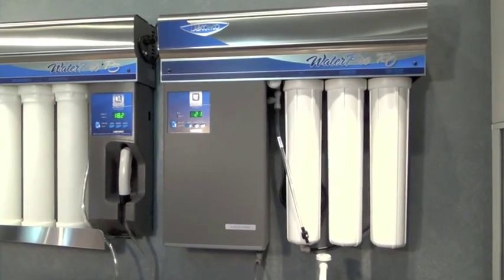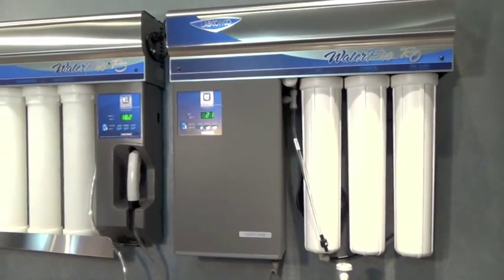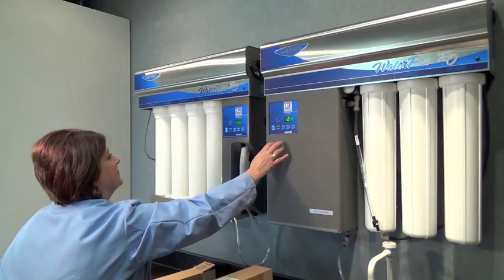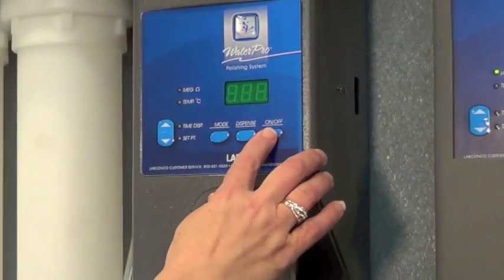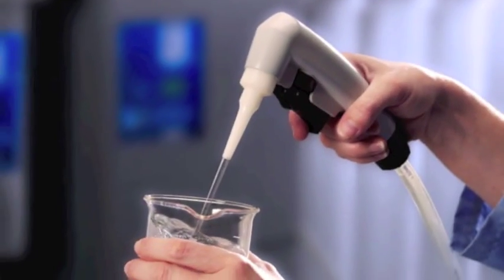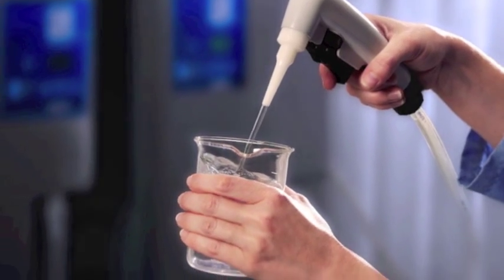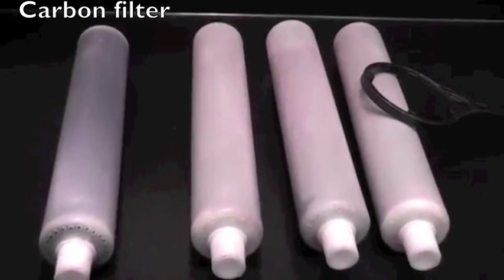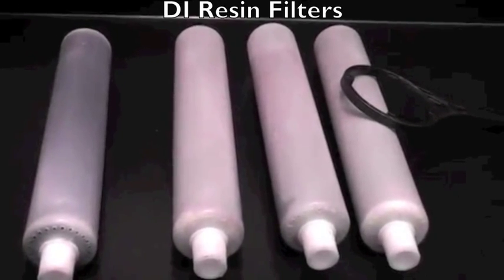LabConco recommends that pre-purified water should be supplied to the WaterPro PS systems for the best performance and enhanced filter longevity. During periods of frequent use, leaving the unit constantly on will provide Type 1 water instantly. WaterPro polishing systems purify water using one carbon and multiple deionization resin filters.